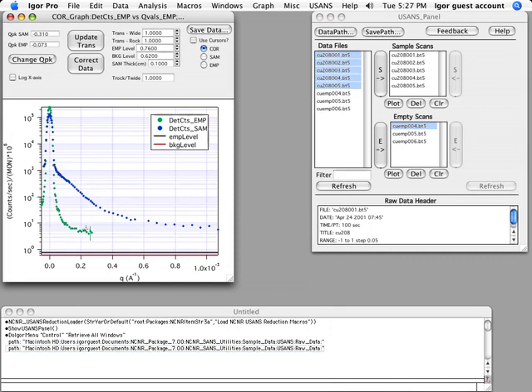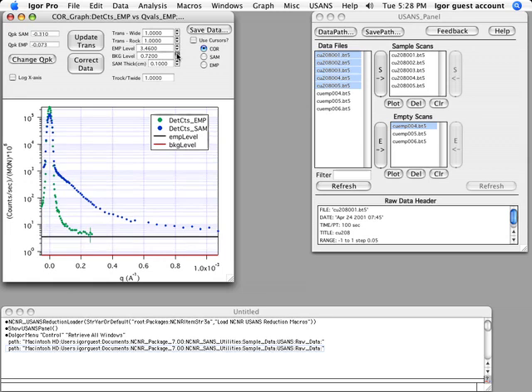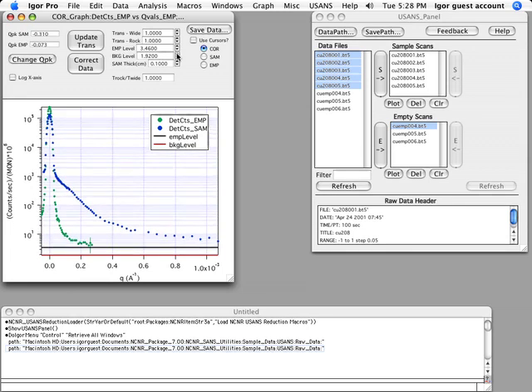We see that the empty scattering is measured over a truncated range, so we can simply manually increase this level to somewhat extrapolate the level of the empty beam, which becomes flat very quickly, and raise the background level to an appropriate value. This is old data, so these values are somewhat artificial. The values that are currently default in the package are current values for what is measured at the instrument.